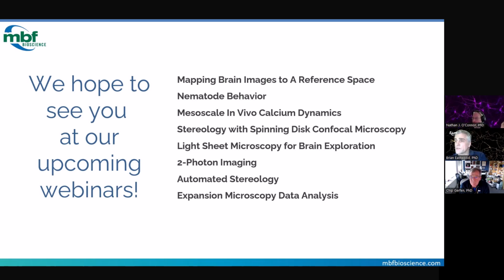Yeah, we can reconstruct it. Right, we can build a 3D reconstruction, but we don't have a model to do that last step to be able to put it into a common reference space, and then make annotations in those sections. Yeah, that's right. The part that we showed today in terms of being able to reconstruct the serial sections can be done all the way through the brainstem.